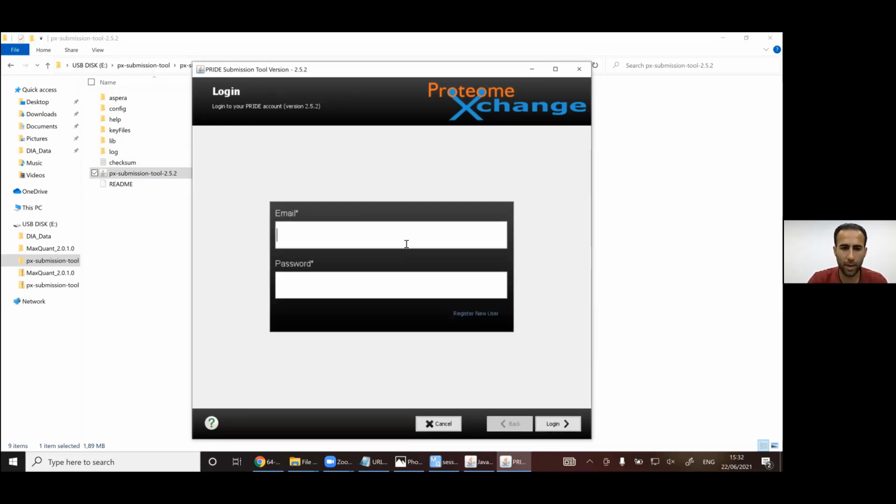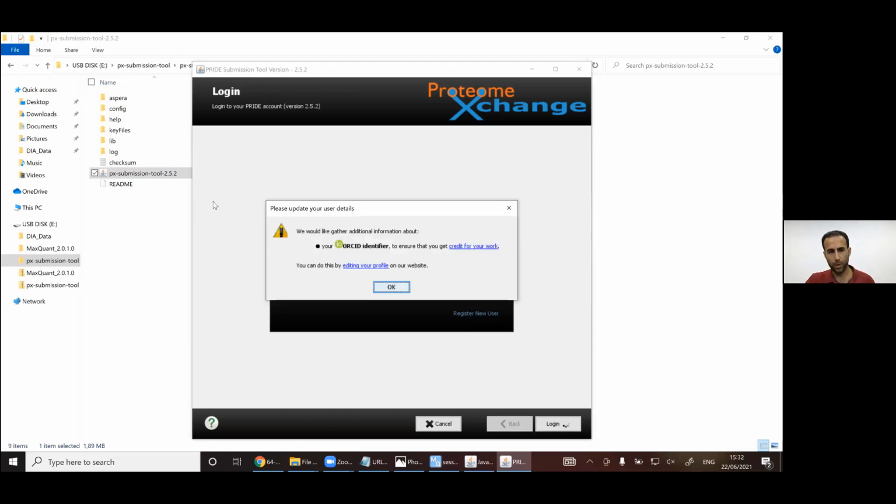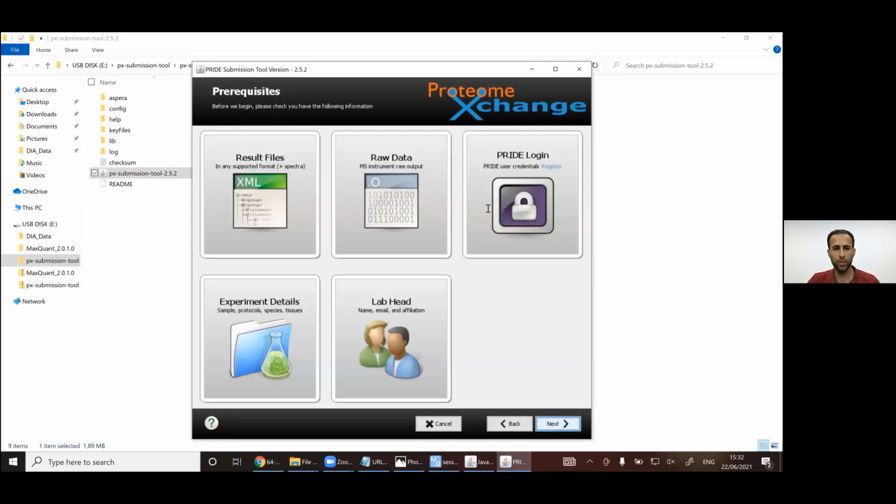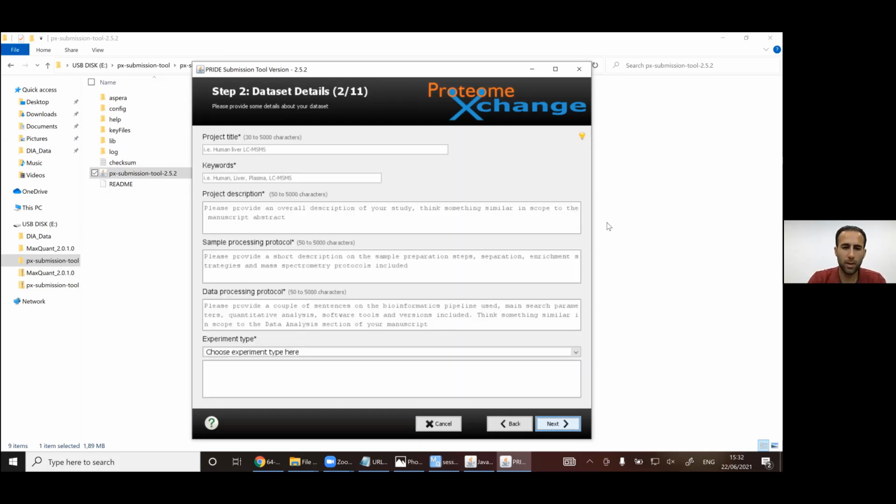I have one. I've registered before. A complete submission is selected by default. Press next, and again next. Then you need to provide some sort of title for your project. I will call it many titles.